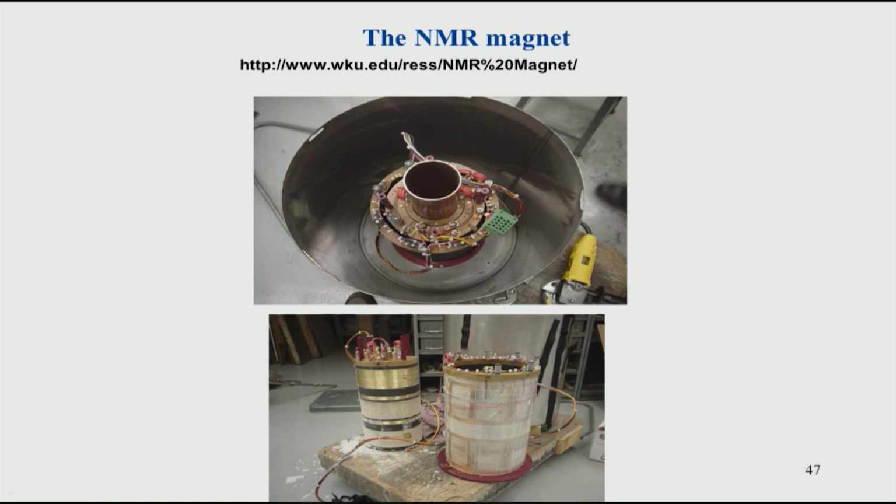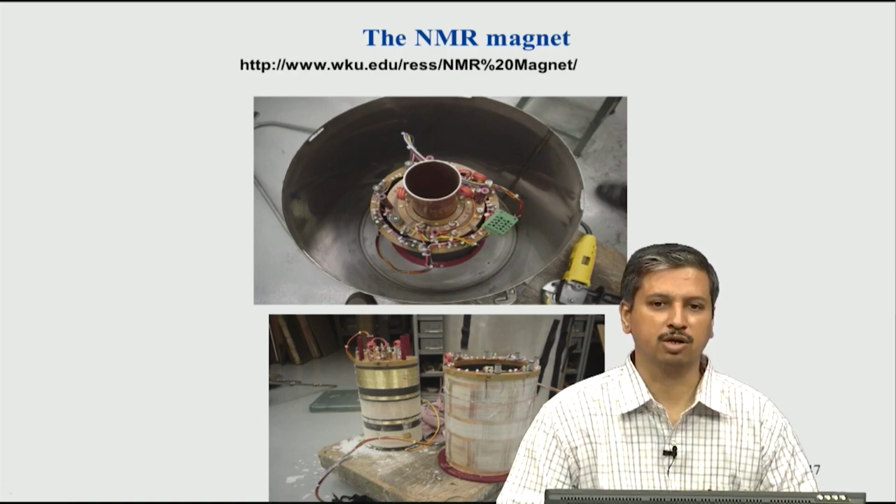So, liquid helium very slowly evaporates and one has to refill helium once in a few months, because slow evaporation is always unavoidable. In the modern day, there are systems where you can actually recirculate the liquid helium. Whatever is evaporated, you can condense it and bring it back. So, you can have what is called a closed loop system, a closed system. The only thing is that it causes some kind of vibration.